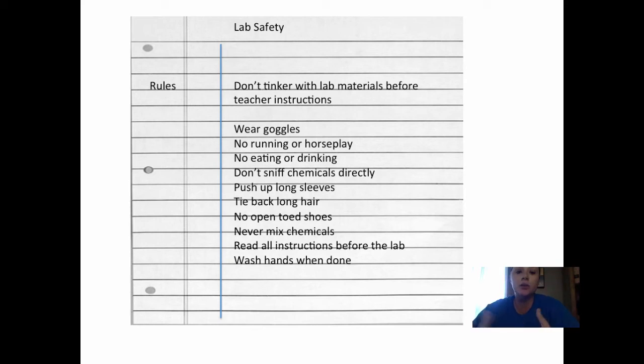If you have long sleeves, you'll push them up. If you have long hair, you'll tie it back. No open-toed shoes, so I'll always let you know if there's going to be a lab where you shouldn't be wearing open-toed shoes. Don't mix chemicals, and then read all the instructions before the lab. Anytime we have a major lab like that, one of your at-home assignments will be that you will actually read the instructions for the lab at home, and then wash hands when done.